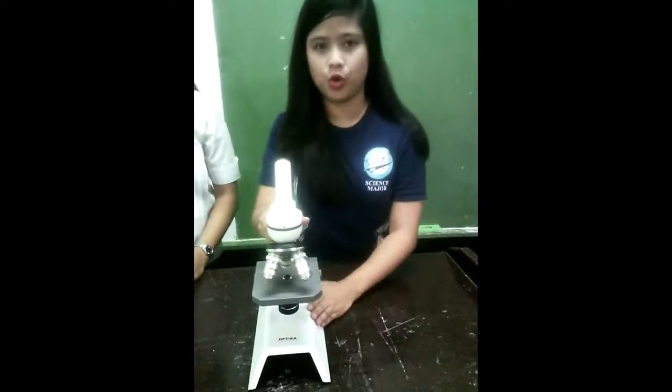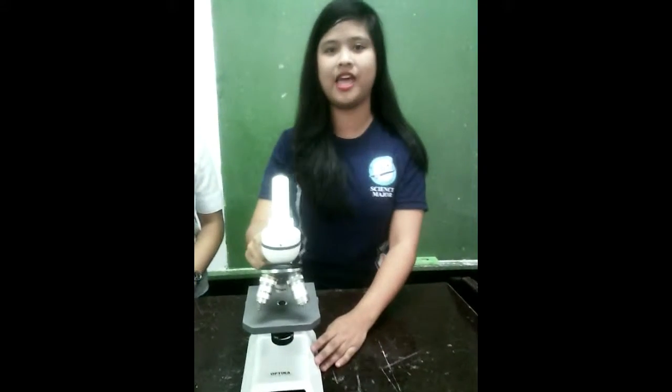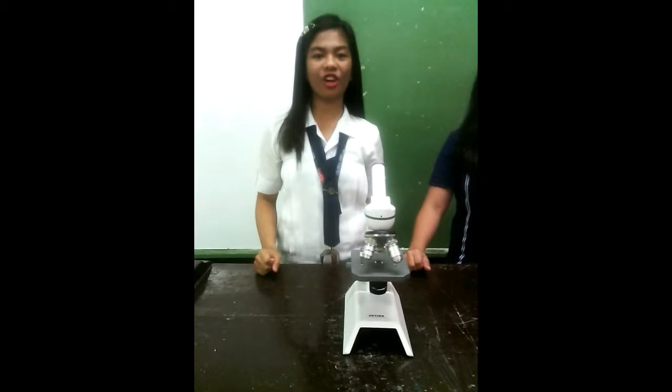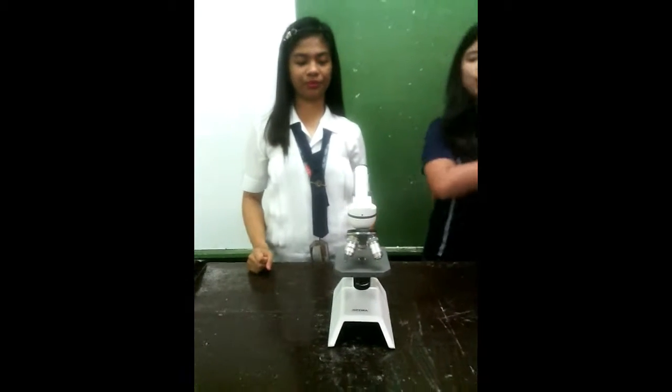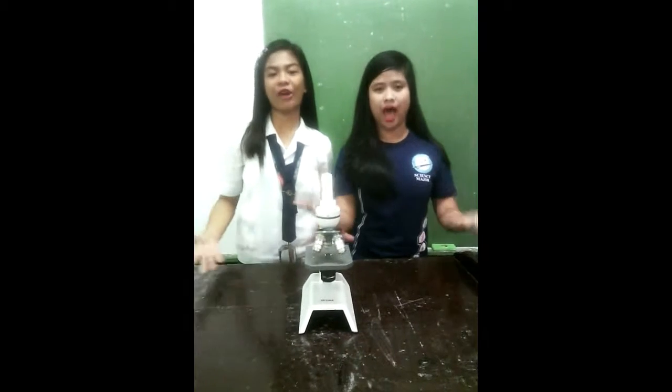The early microscopes used by Anton van Leeuwenhoek were described as simple since they only had one lens. Also, in 1595, the Johnson Brothers invented the compound microscope. With that, let us know further about compound microscope and how it works.